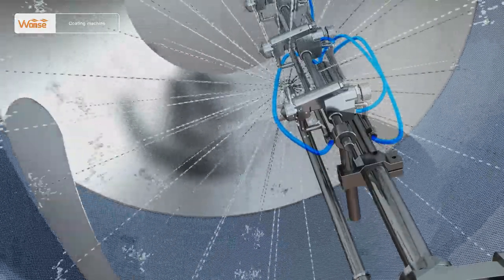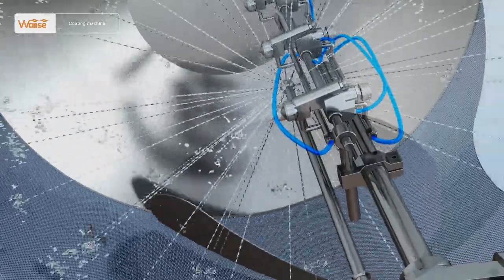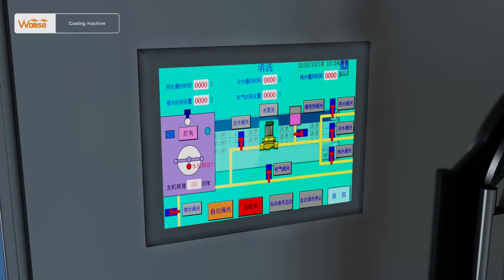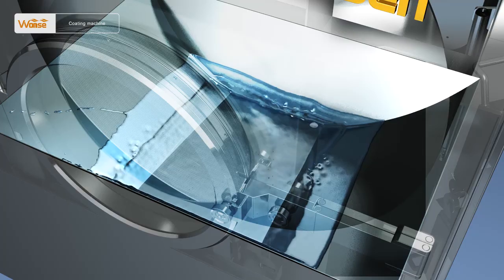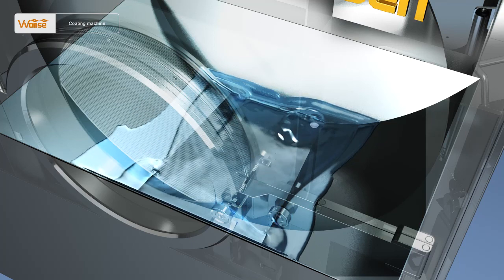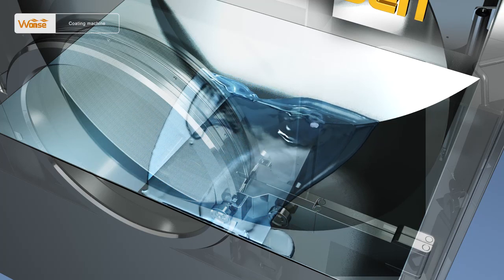Third, run the boosting pump, open the circulating water valve, and start the circulating cleaning. Fourth, after the process is finished, close the circulating water valve and open the drain valve to discharge the water in the cleaning tank until the lowest water level is reached.